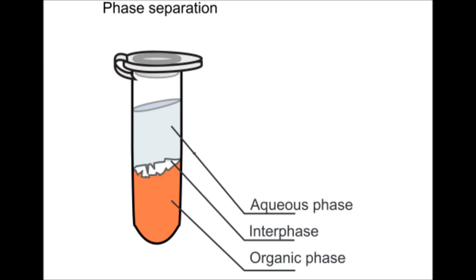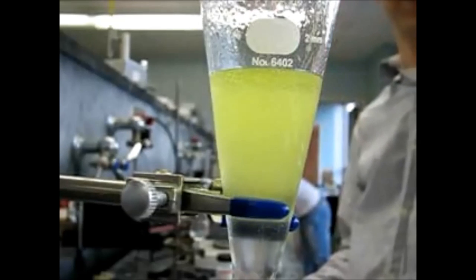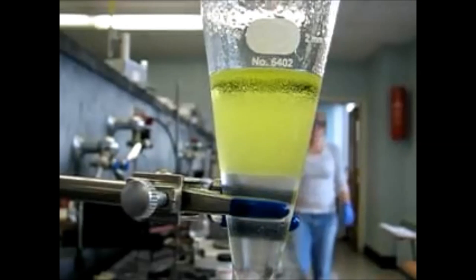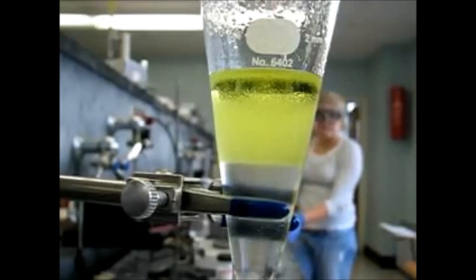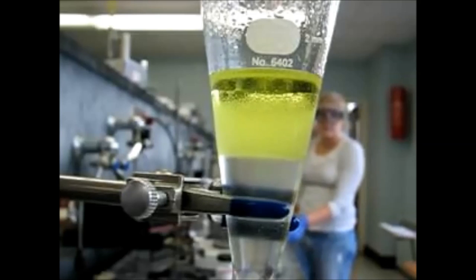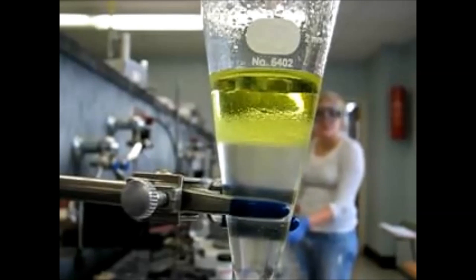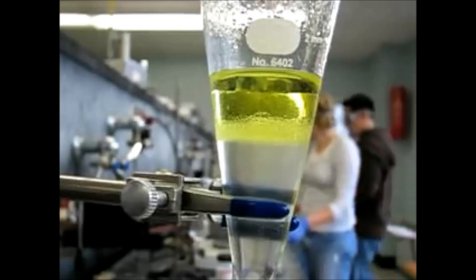You can separate an organic molecule from a mixture by extraction with an organic solvent. In this video you can see that as this mixture is allowed to separate, different layers form. The cool thing that happens is that as the phases separate into organic and aqueous, the organic phase drags, or the proper term is extracts, organic molecules from the aqueous layer into its own phase.